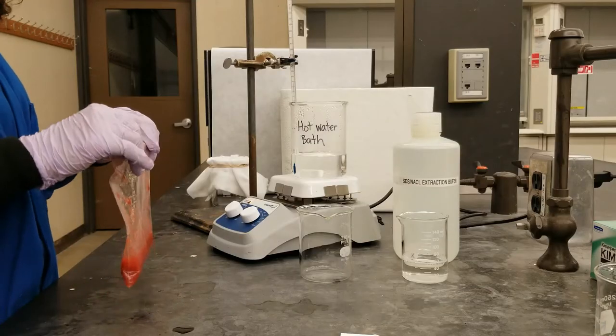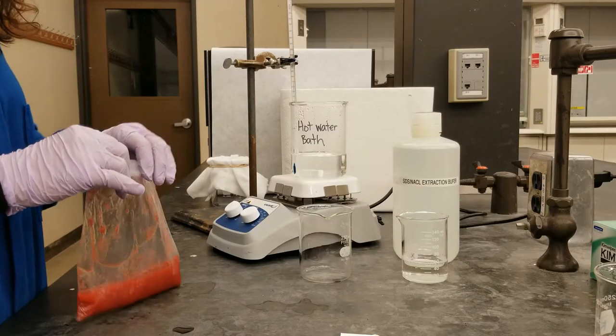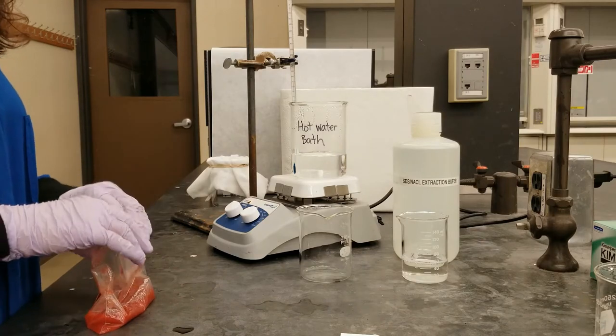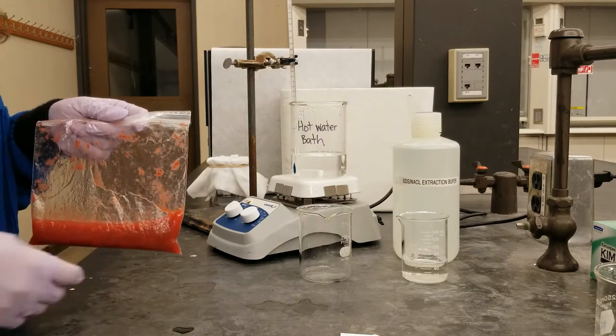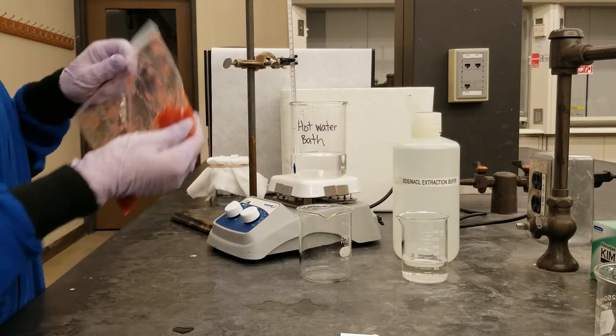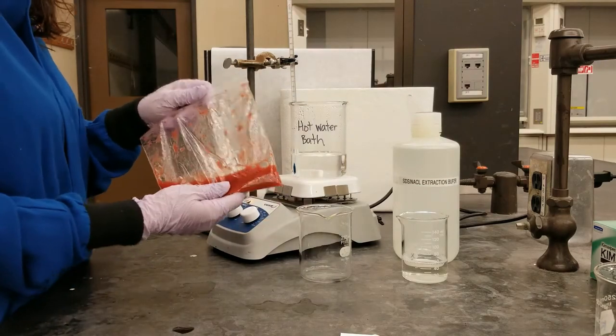In today's lab, we'll be doing a DNA extraction. DNA is the genetic makeup that makes up almost all living organisms. So in today's lab, we're going to be working on taking the DNA from strawberries.